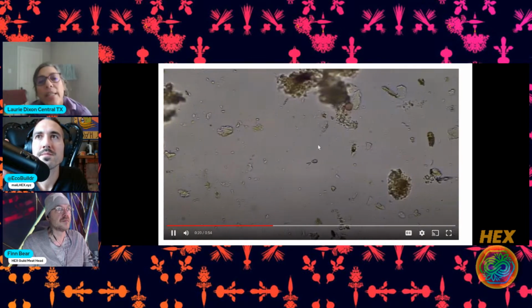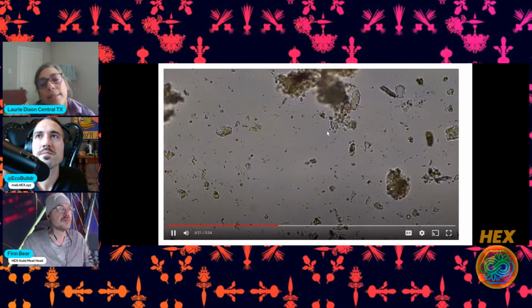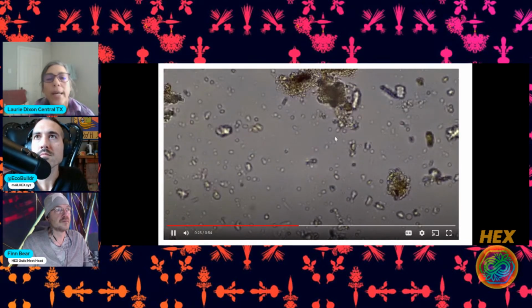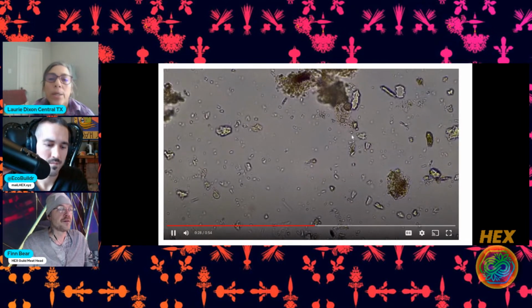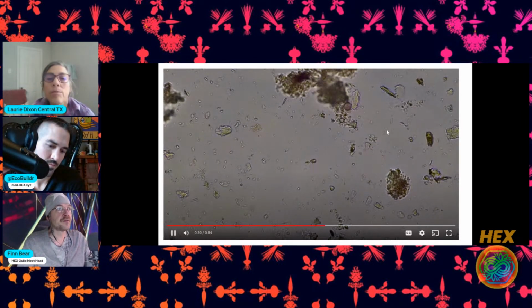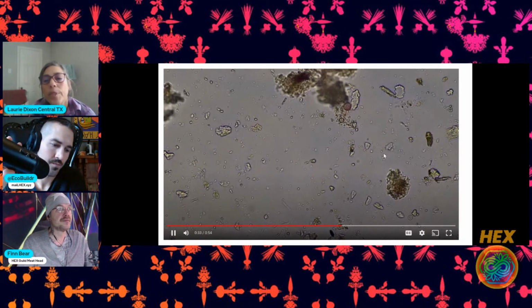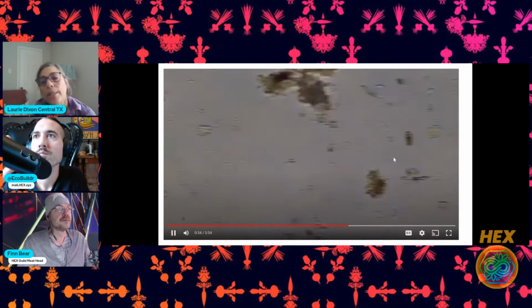So it's funny, you can't really see his body because he has this aggregate that's on top of him and he's dragging it around. But just the way he's moving, we know he's a flagellate. They kind of bumble along. Sometimes you can see that flagellum.